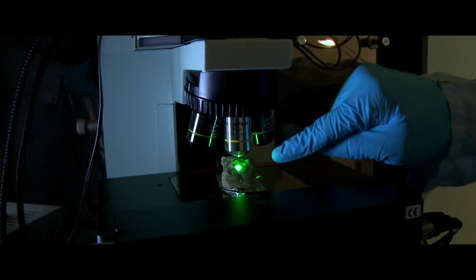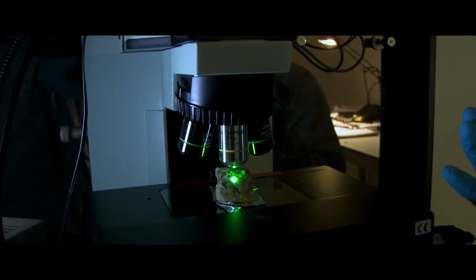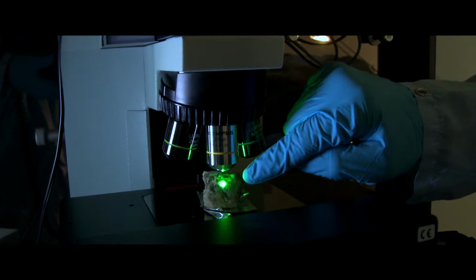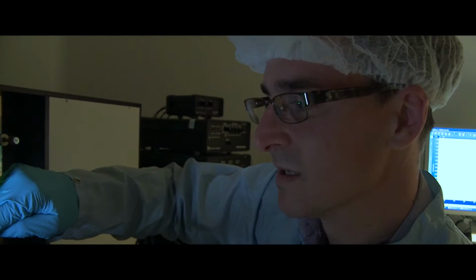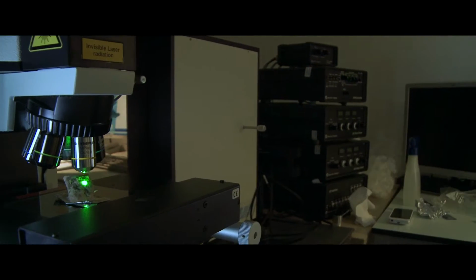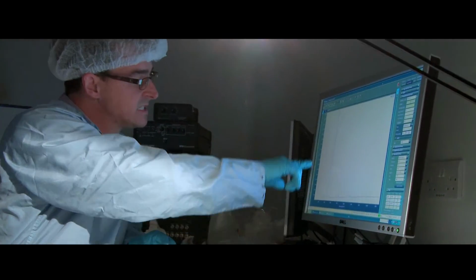And what Raman does is it shines a laser beam onto the sample, and that light bounces around, interacts with all the molecules inside the target. So the light you collect contains information about the kind of molecules that are inside the sample. And when you look at the spectrum on the screen, you get a spectrum like this coming out. And these spikes in the Raman spectrum are the fingerprints of that quartz. This is how you identify the kind of rock that you're looking at. And particularly this very intense peak, about 464 Raman shifts.